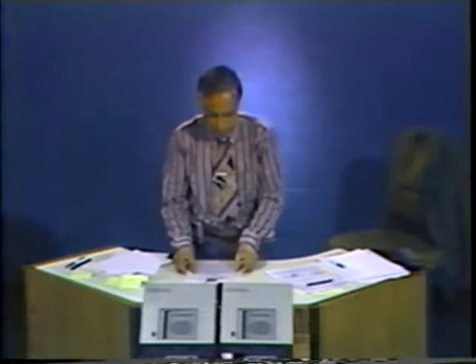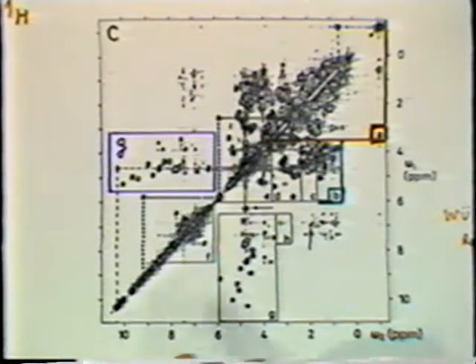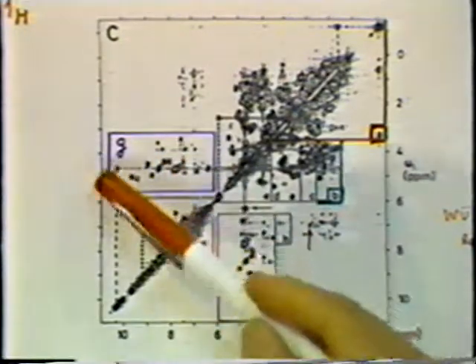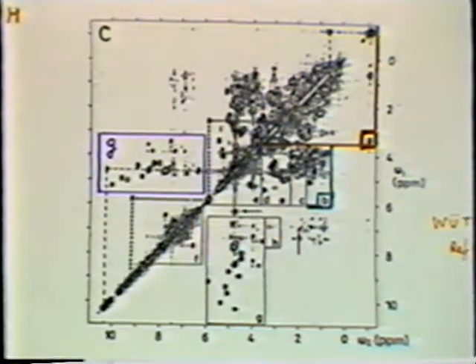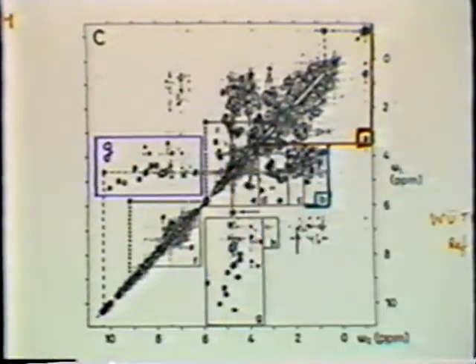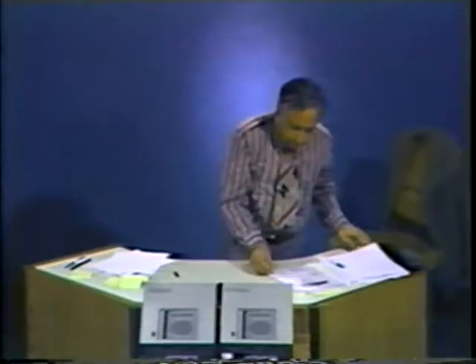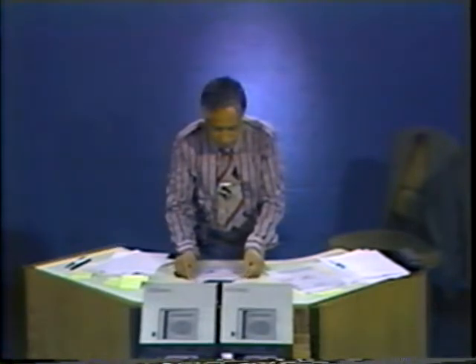And so you have the G region, which is from the NH protons, the amide protons, to the alpha protons. This is a very useful region, and it's called the fingerprint region, because basically we get one cross peak per residue in this region. It is the starting point of assigning a protein. The fingerprint region is which we often look at in great detail.